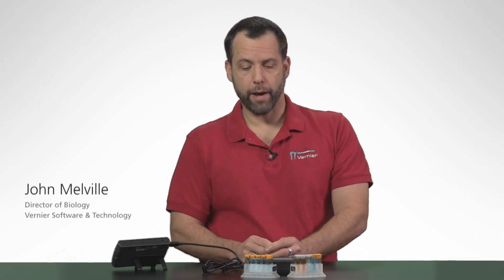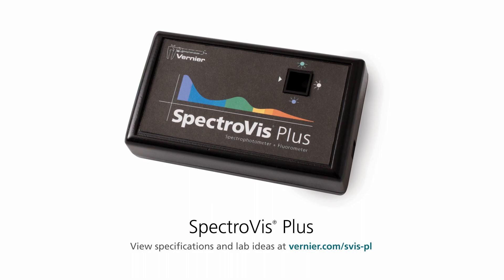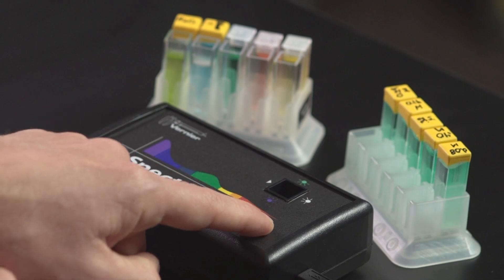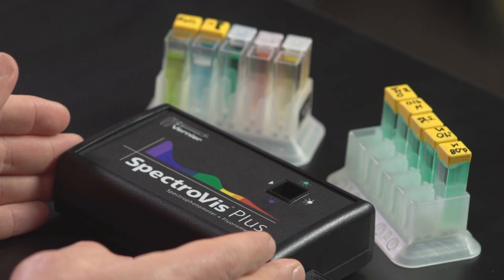Hello, I'm John Melville from Vernier Software and Technology. I'm here to talk to you about our little spectrometer, the SpectroVis Plus. This is one of my favorite devices that we have here at Vernier. It's what we call an array spectrometer. So unlike older spectrometers that only looked at one wavelength at a time, this device can actually look at an entire array of wavelengths — all the way from the violet up into the red — and it can do that simultaneously. So you can use this device to actually look at the complete absorption spectra of a compound, be that nickel sulfate, chlorophyll, or red food coloring.